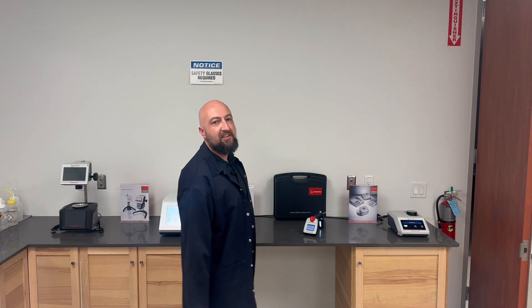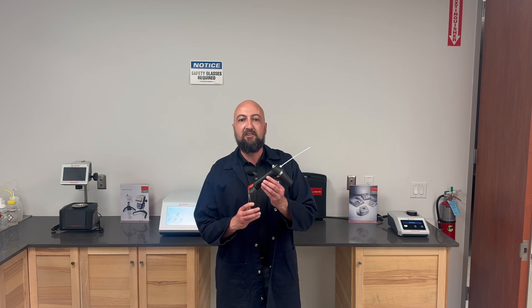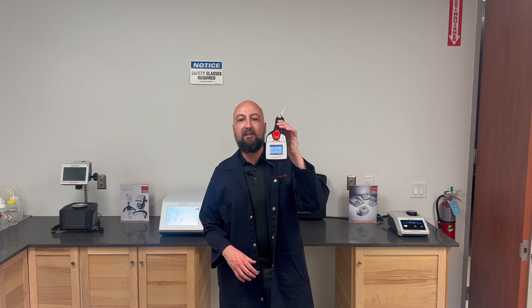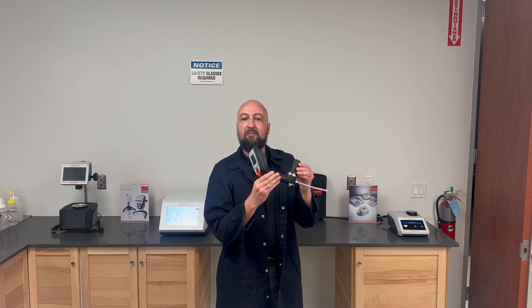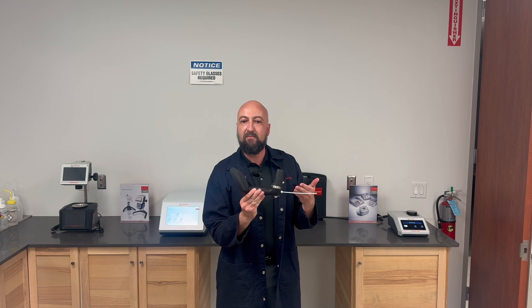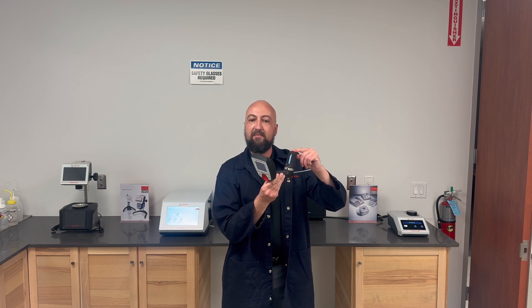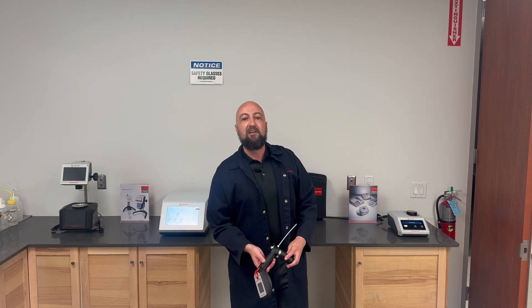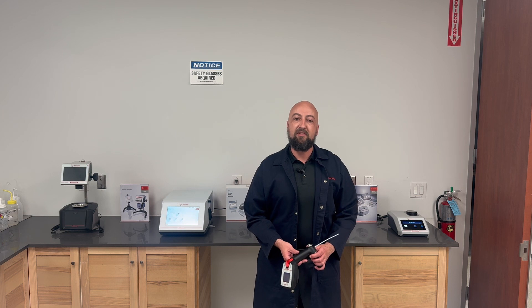Now that we're in the lab, let's take a closer look at the DMA35 itself. This device is lightweight, compact, and built for tough environments. The bright backlit LED screen rotates and uses touch keys that even work with gloves. It features a manual hand pump for quick sample intake and a durable measuring cell protected by rubber housing. There's even a built-in LED so that you always know your sample is clean and bubble-free. For hazardous environments, Anton Paar developed the EX version that's intrinsically safe and compliant.